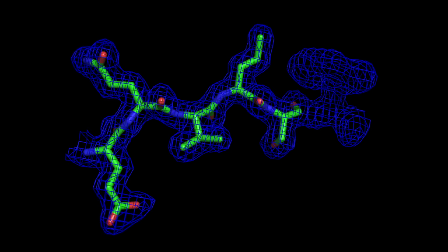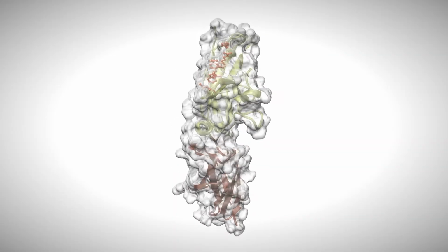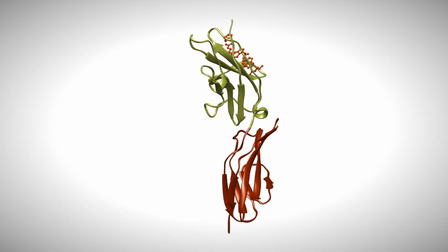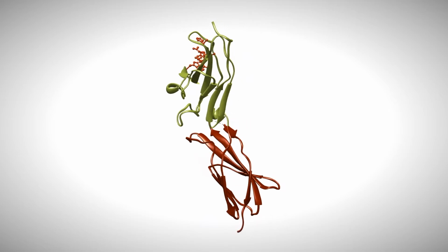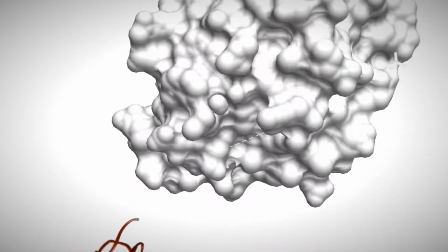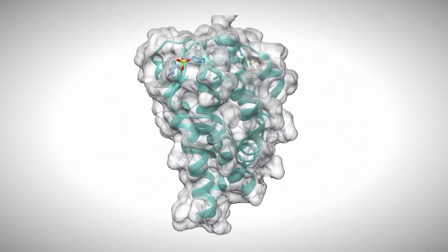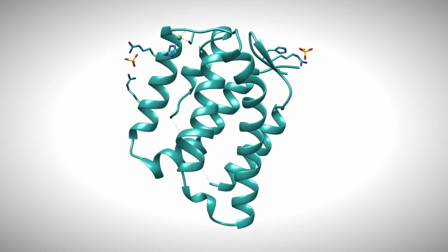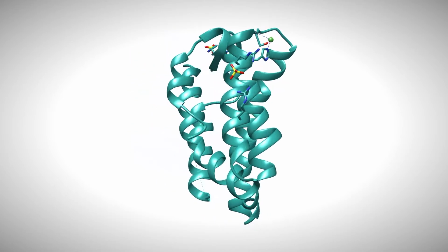Recently, we've solved several protein structures. Specifically, we investigate the structure and function of interleukins and interferons. They are proteins especially important in the immune system. Their dysregulation causes serious autoimmune diseases such as psoriasis, rheumatism, and multiple sclerosis.